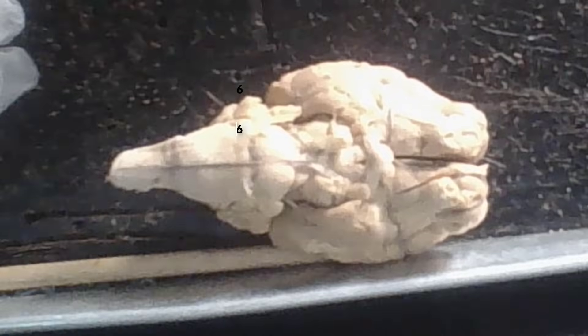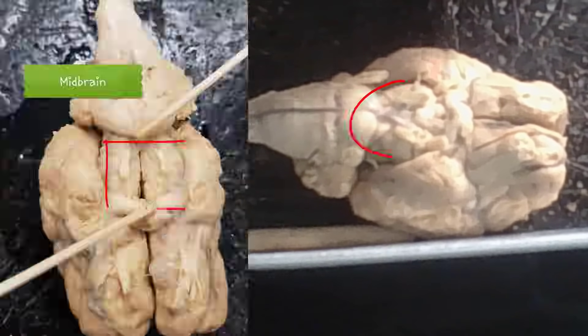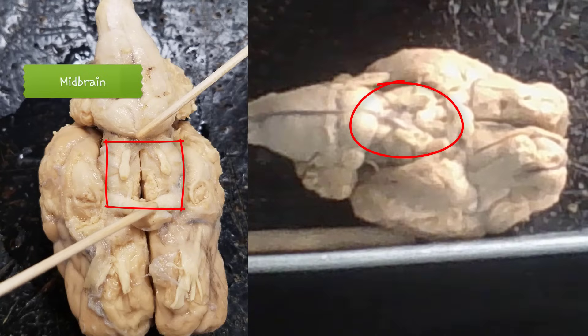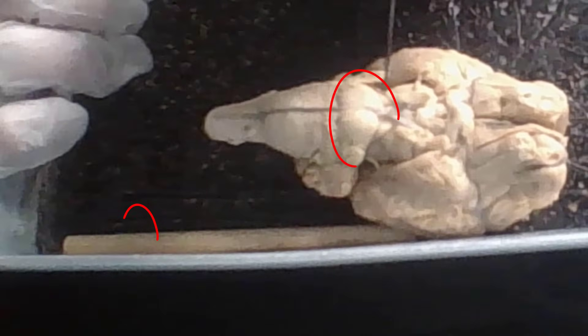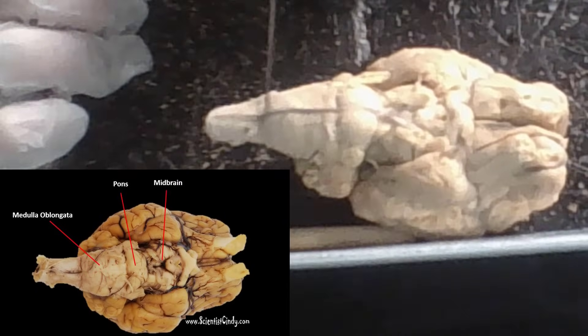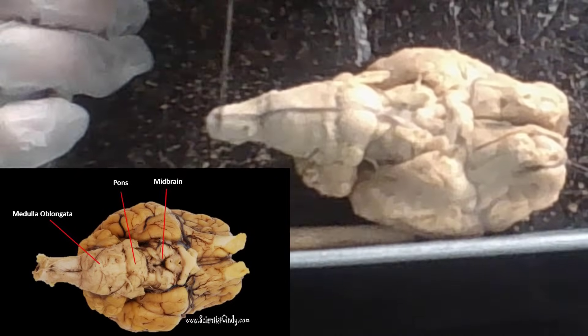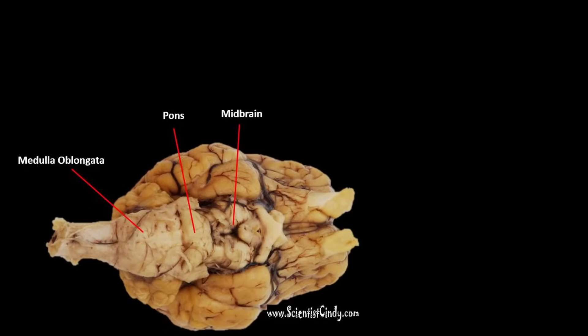From the inferior view, this entire region is the midbrain, which is part of the brainstem. This area here is the pons — it's much easier to recognize from this view, with its characteristic bulge. After the pons, from here to here is the medulla oblongata, and from there down is the spinal cord. And that is the brain!